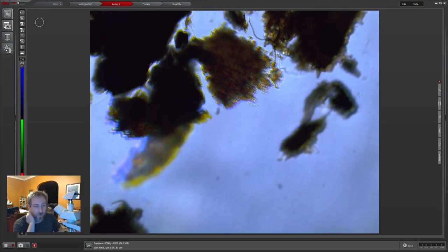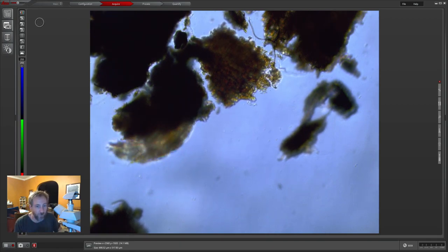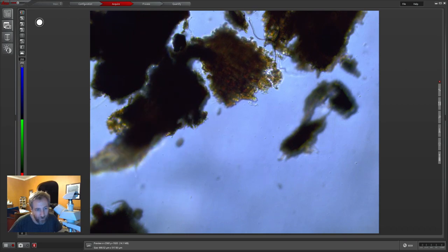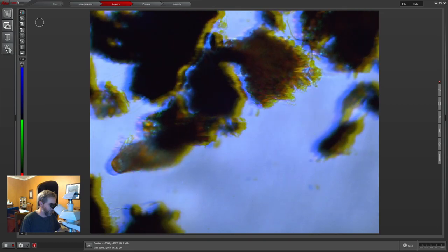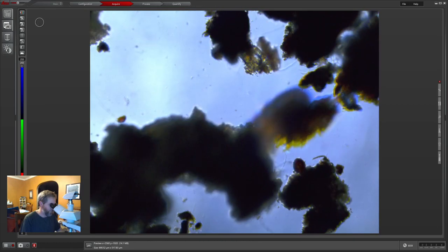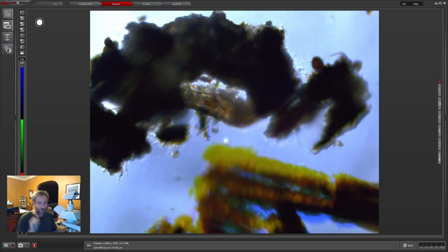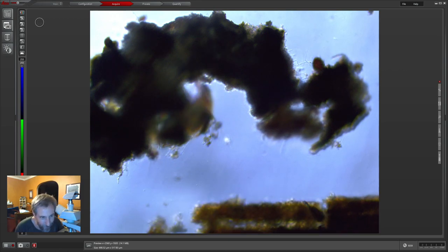Can water bears see? Some water bears have eyes, and if you look closely at this one you'll see it has two little tentacle-like things coming out of its cheeks — sometimes water bears have little eye stalks on the ends of those, and sometimes those are just little sensory antennas. It's really hard to see because it's moving around so much. It's got maybe six little things coming around outside of its mouth and then these things come off the sides of its head. So it might have eyes.